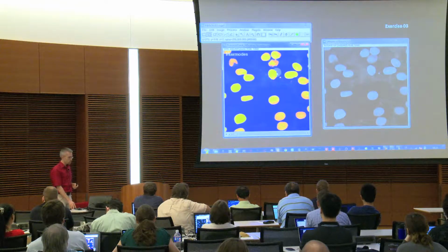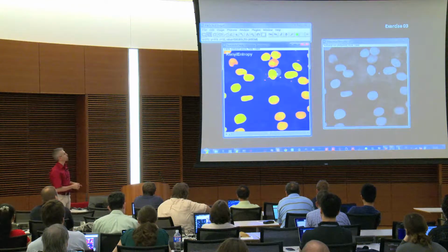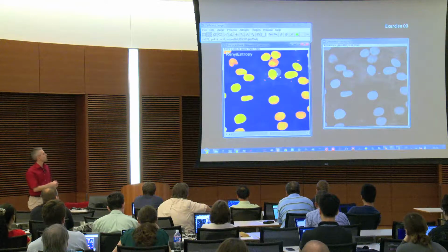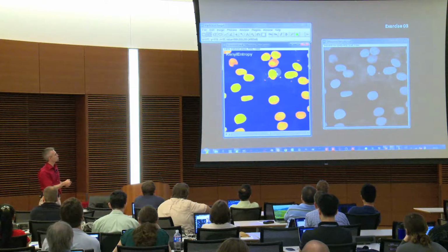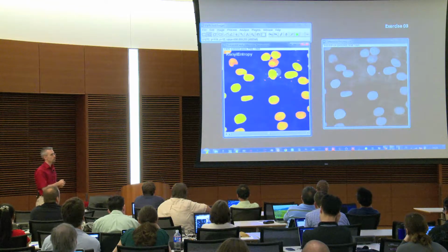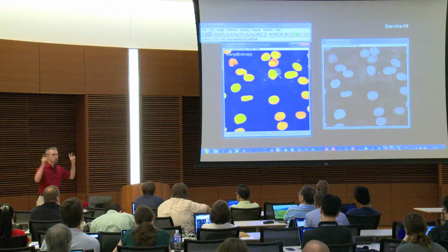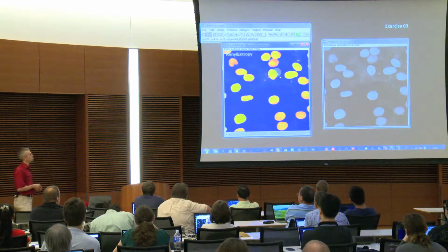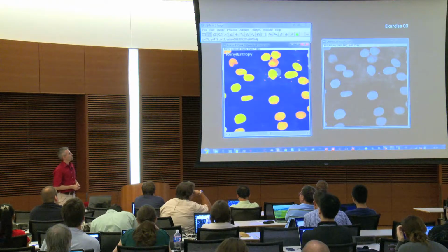And in this range, when you go through, actually the best one, if you use the median filter of 4, is the Renyi entropy, because it has all the outlines, it has smaller connections than the other ones, and it does not have so many unwanted particles in addition. So based on that, I would choose that one.